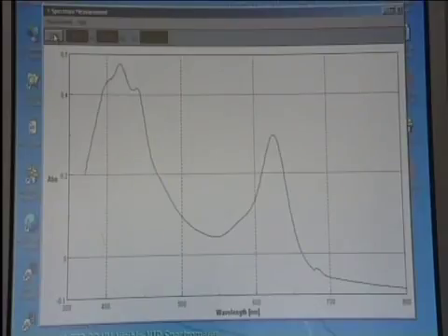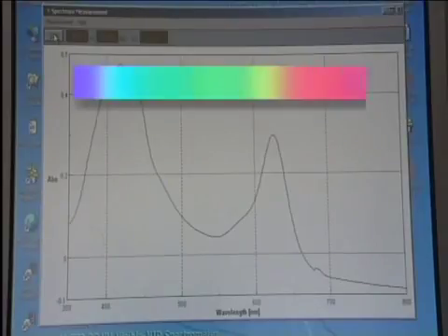The peaks on the spectrum are the wavelengths of light that are absorbed by the sample, and the troughs are where light passes through. So the dye absorbs orange and blue light and lets through green. So it appears green in colour.